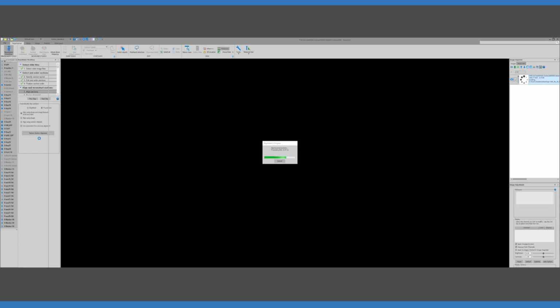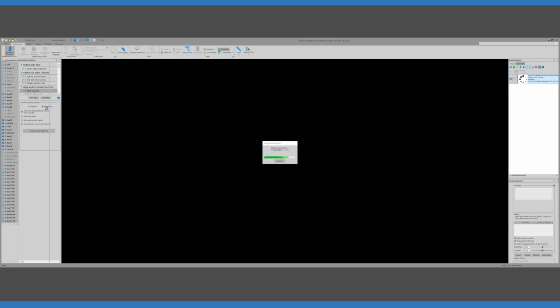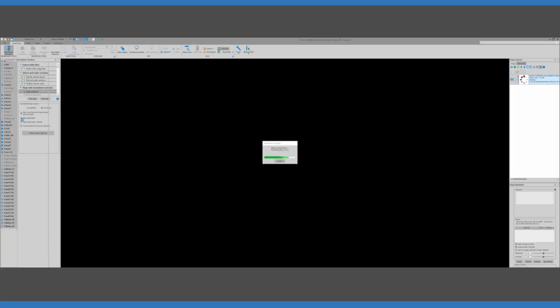And then the third option is the fastest option, which is to align the centers of the section. It's the fastest because basically we find the center of mass of each section, and we just subtract the positions of those, and that gives us the translation between those sections. We don't do rotation, we don't do flipping in that case.